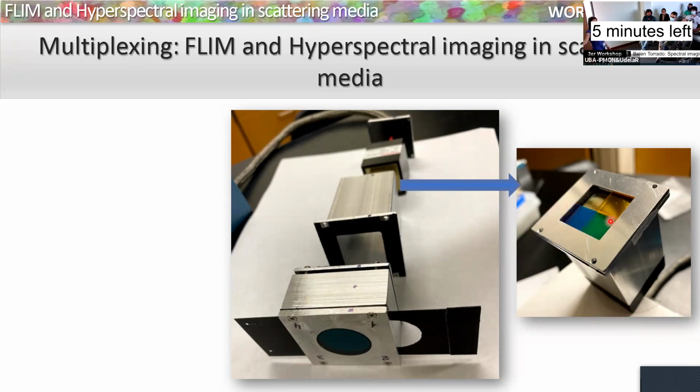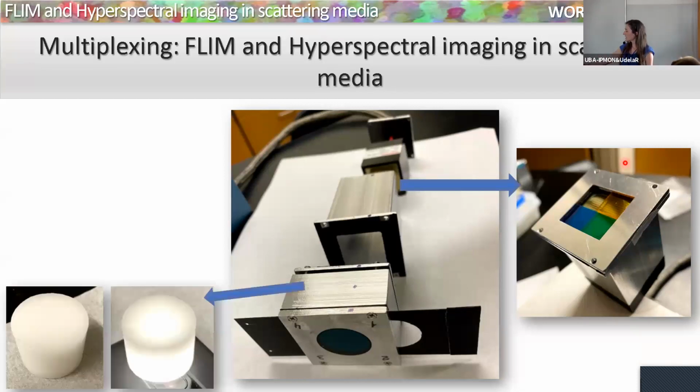In this case, we have sine and cosine filters. This is the total intensity with no filter. Here we have our linear one, but we can combine and put all different filters of whatever we want, and also measure FLIM at the same time, and we can put an NADH filter, etc. The other thing is that from the excitation point, all the photons arrive to this wide area detector, and we need the photons to travel to the different channels.